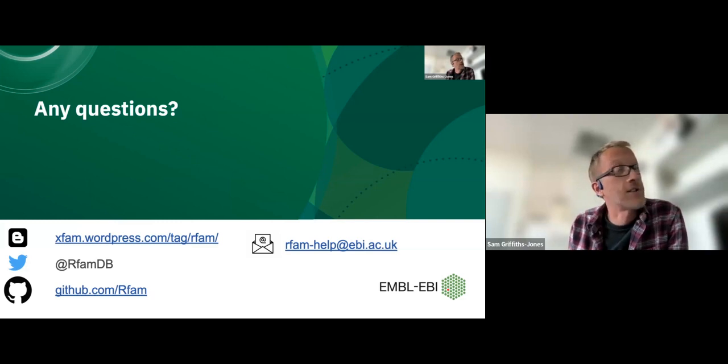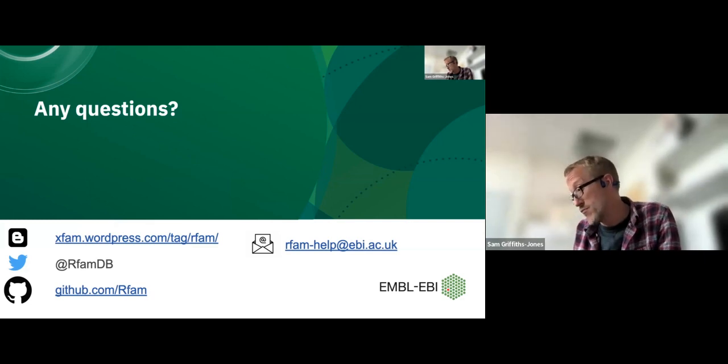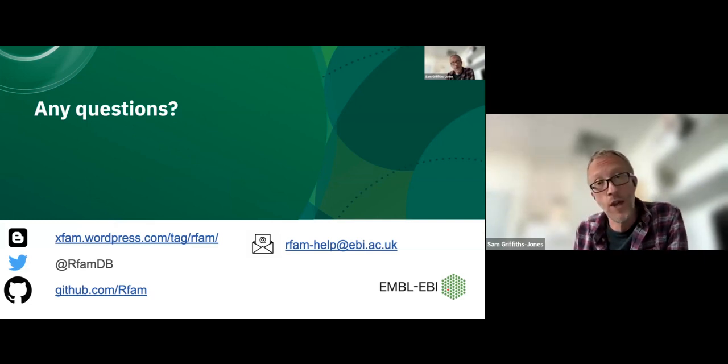As I say, if I were to get into the detail of that much more right now, I'm going to quickly tie myself in knots. But there's a bunch of papers, first of all from Sean Eddy, who wrote the first version of Infernal, which describe the application of these models to RNA, to finding homologs of structured RNAs, and do go into it in more detail. While we're still talking, I'll try and find some of those papers and stick them in the chat. Thank you, Sam.